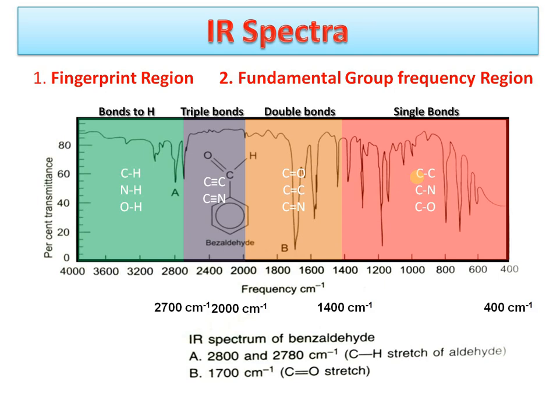Now further, the region from 1400 centimeter inverse to 4000 centimeter inverse is called the fundamental group frequency region. Here the peaks obtained in this region will be due to the vibrations in a molecule containing a specific functional group.